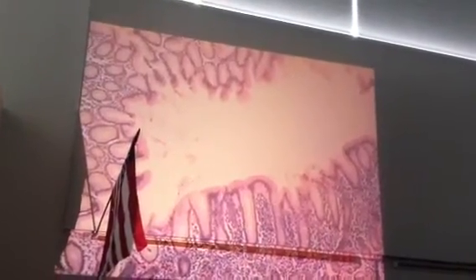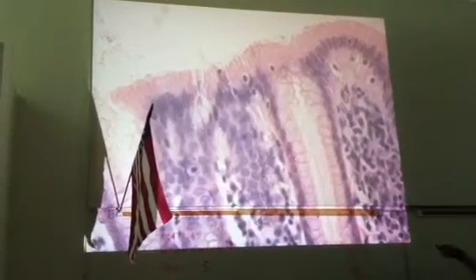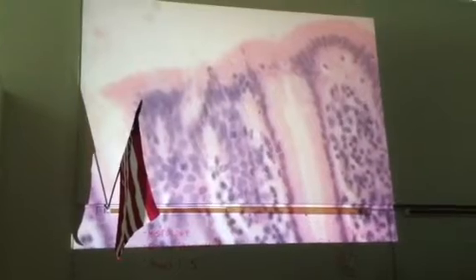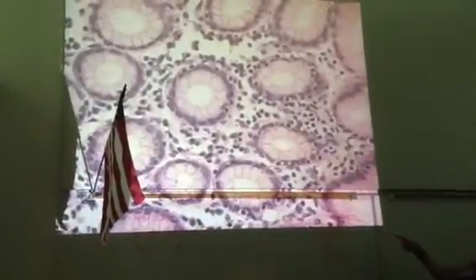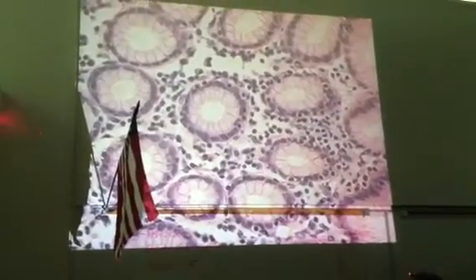These are mucous neck cells. The nucleus is always to the base, and just mucin droplets up here. The nuclei sit down at the base. Now we look at that, and it's cut 90 degrees different across the way, and we'll be looking down into it, and that's what we see right over here. Same thing. So nuclei to the base, and you can see how closely arranged these are.